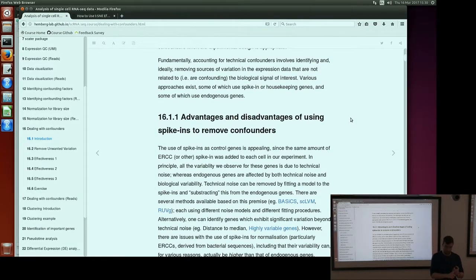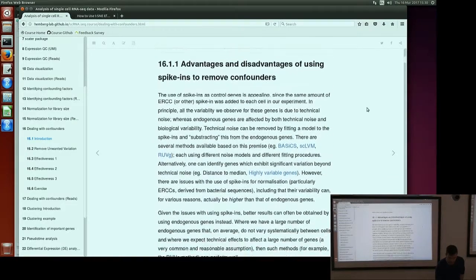Also, the way we do the assessment, or decide what is effective in terms of some of these batch effect correction methods, is a little bit subtle as well. So I'll try to explain them as well as I can, but feel free to chime in any time when things are not clear, because we do have time to discuss these and tease out some of the underlying issues. That's the plan between now and the end of the day.